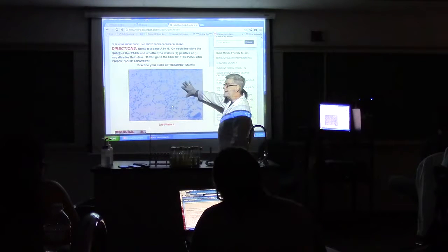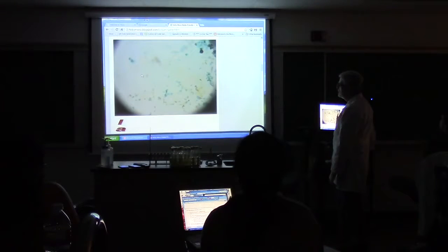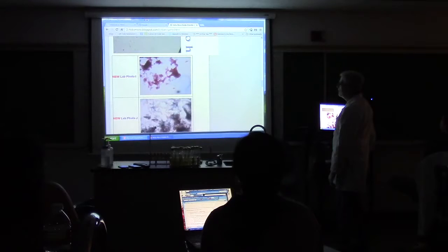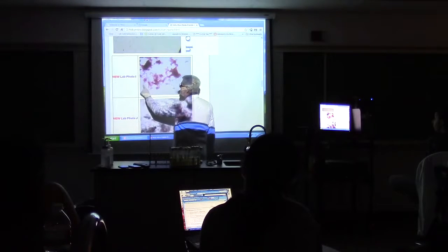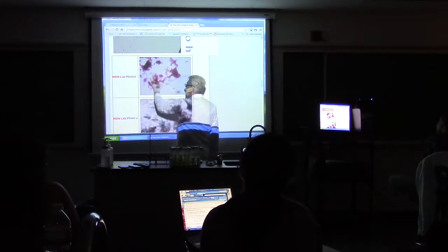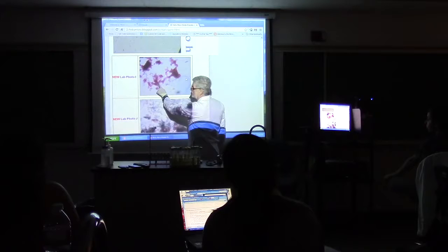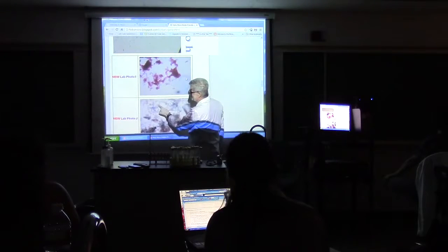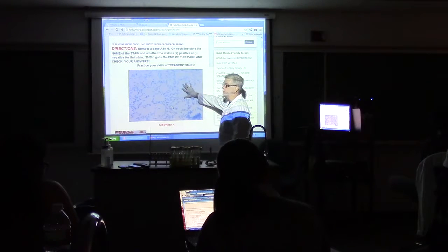So this one on the test, let's go down to, there. This is one that's been cooked a little bit too much. There's a few baby blue here. It's mostly hot pink. Now, there is a difference between this pink and that pink. This is hot pink. This is E. coli on an acid-fast stain. How do you know? It's baby blue.